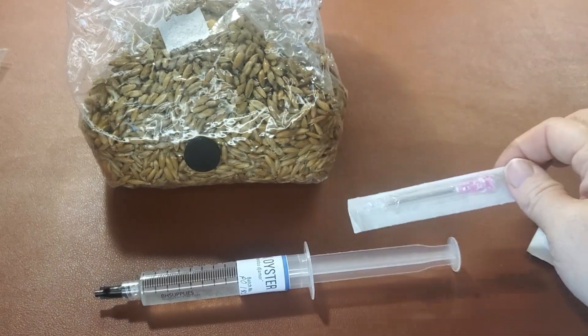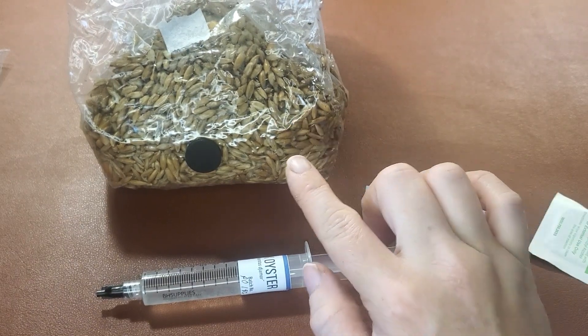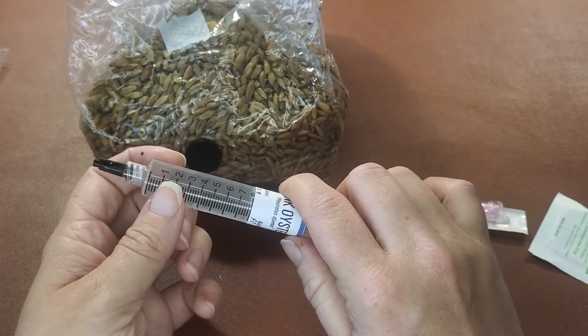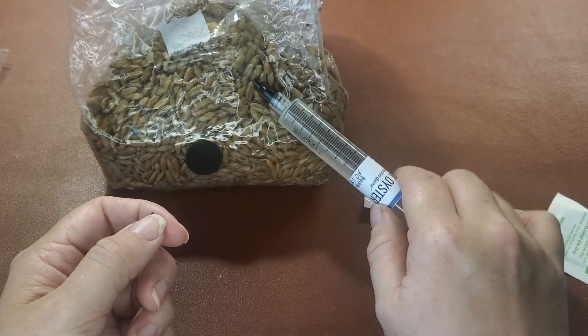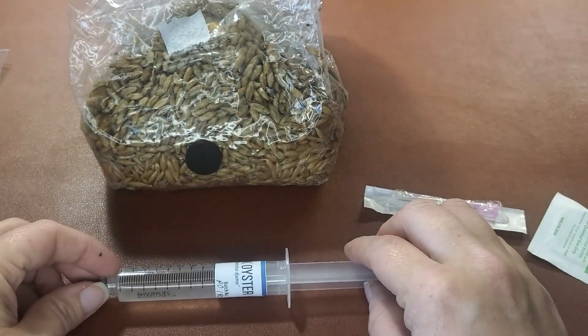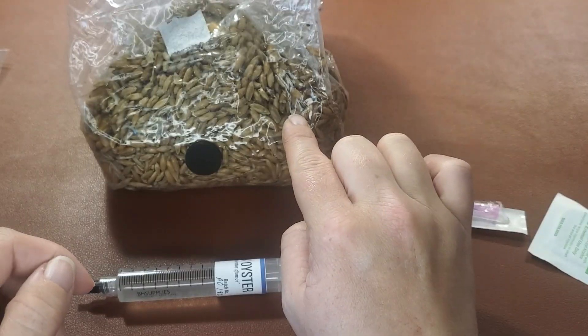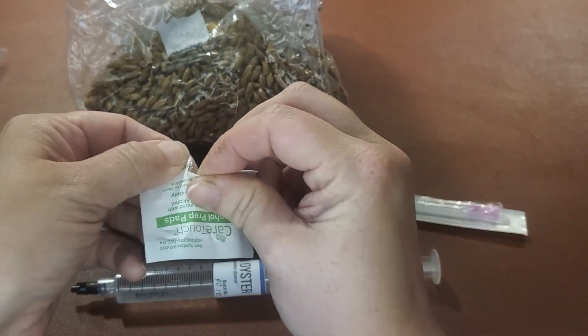This is a one pound bag, so the rule is one cc — this much per one pound of grain. You can double it, but I would encourage you to be careful about adding too much liquid to your grains, because when you do, that's when you open yourself up to a higher contamination rate.